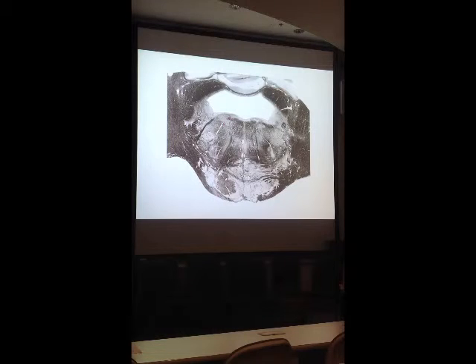But remember, even though it's called the facial colliculus, what nucleus dominates that colliculus? That's the abducens nucleus. These are lower motor neurons that send their axons right down through here. These are the axons of the abducens nucleus, and they're going to exit just off midline as a sixth nerve at the pontomedullary junction. So there's a hint here as to what that nucleus is. What muscle do these fibers innervate? The lateral rectus muscle.